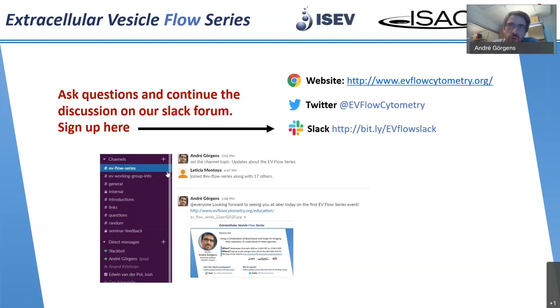And of course, what is meant also is that if you put EVs that have a lot of different surface antigens at vastly different abundance to 39 different beads, they might bind based on their antigen profile to different bead subsets. It's not absolutely stochastic, probably. While this is hard to really study without having all those bead subsets separately, we just consider the results from that assay as a rough estimate of how abundant or how positive EVs are for a certain antigen.